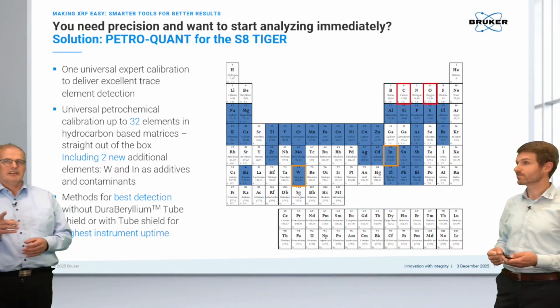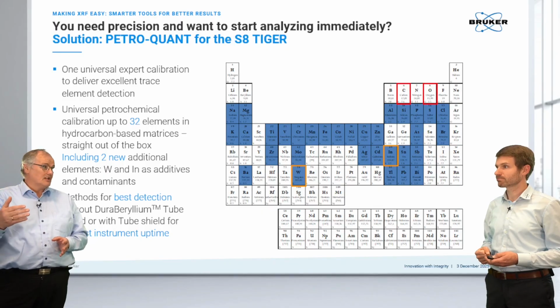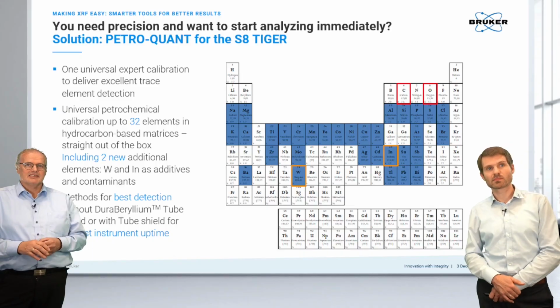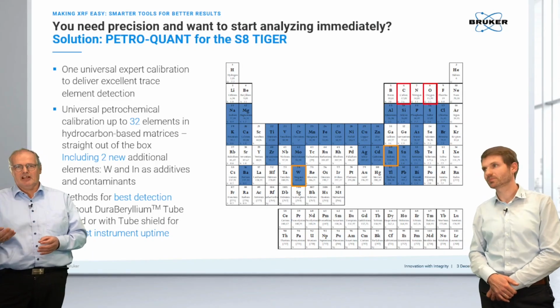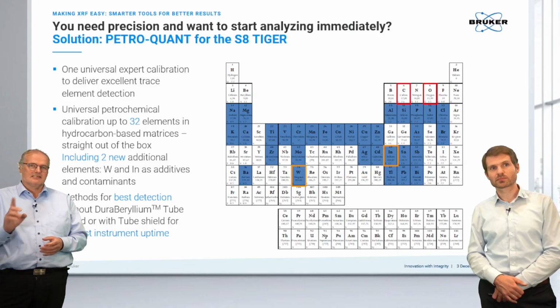The interesting thing is actually, in here we have not a user calibration. We don't have the complete solution standardless. It's something in between. So we have calibrated the system, and actually for you, it's standardless. This is the one thing.